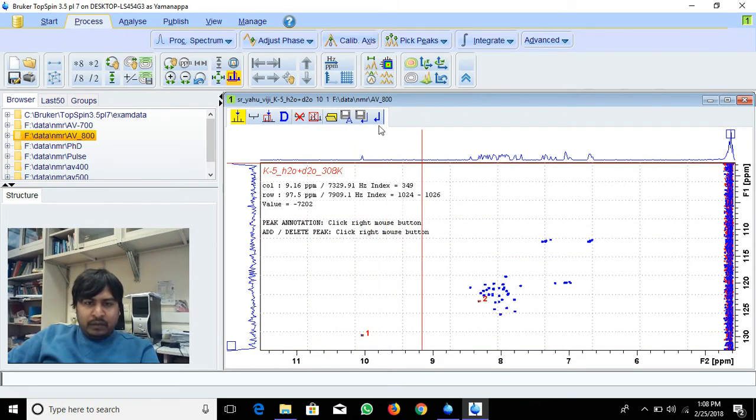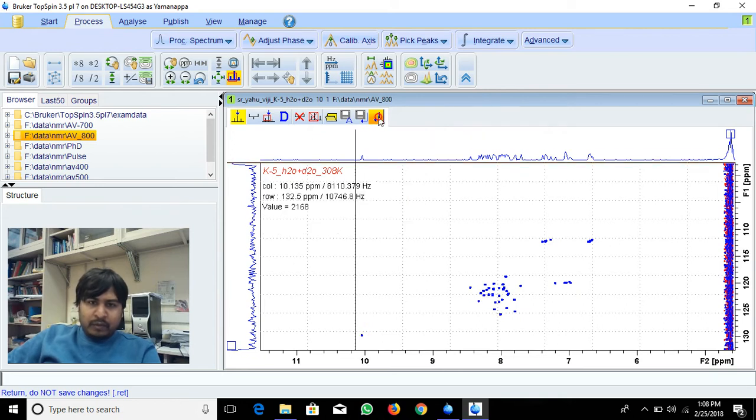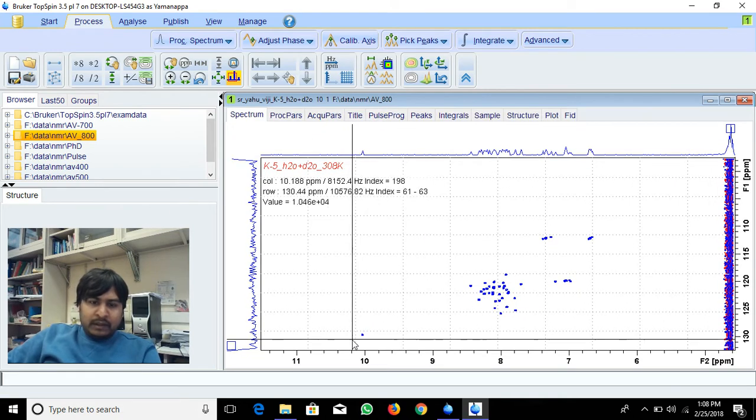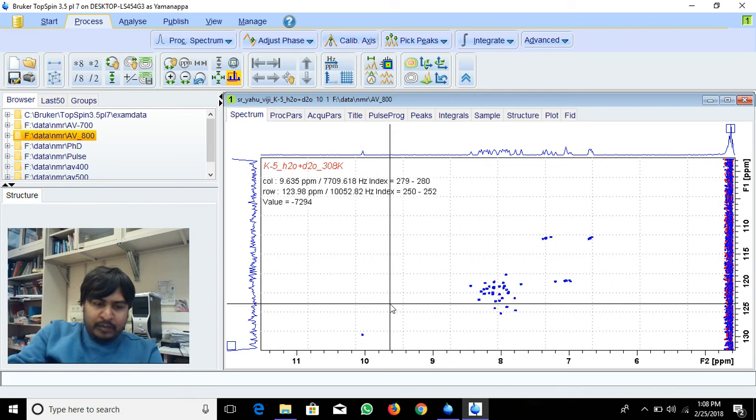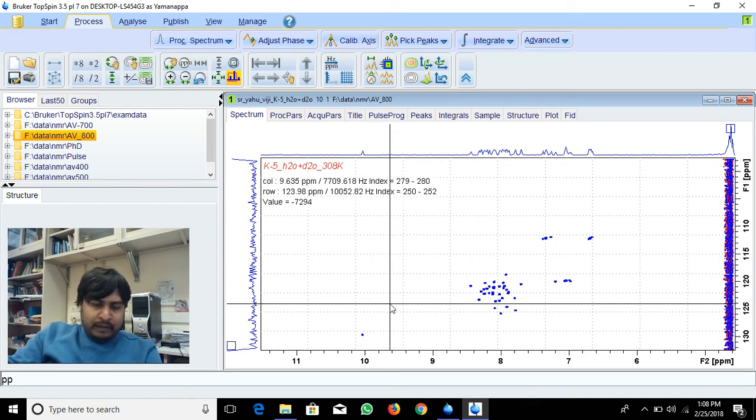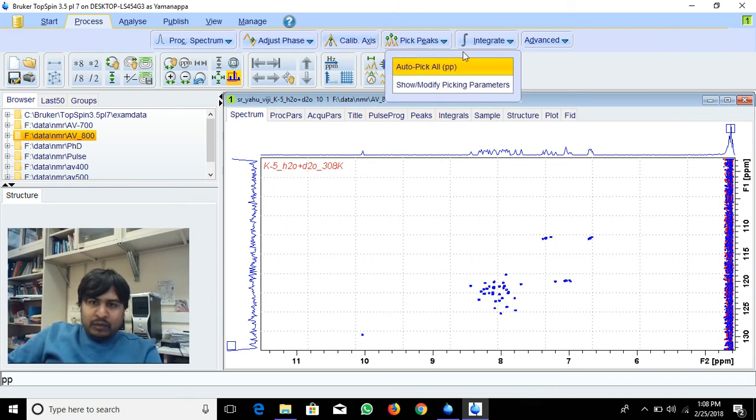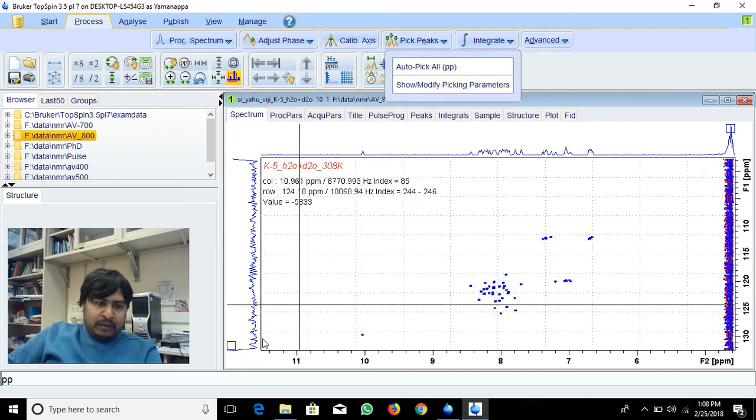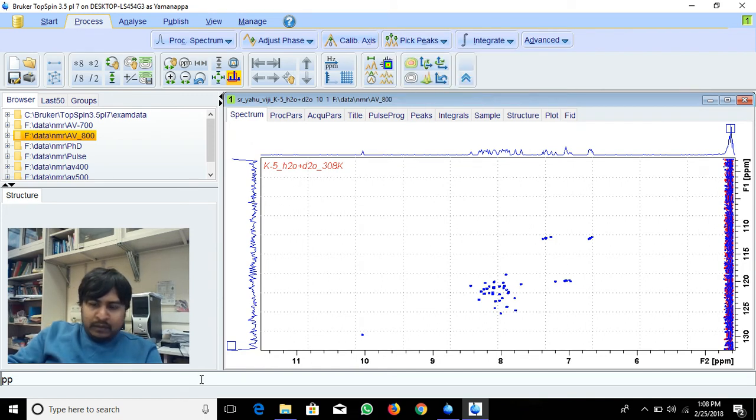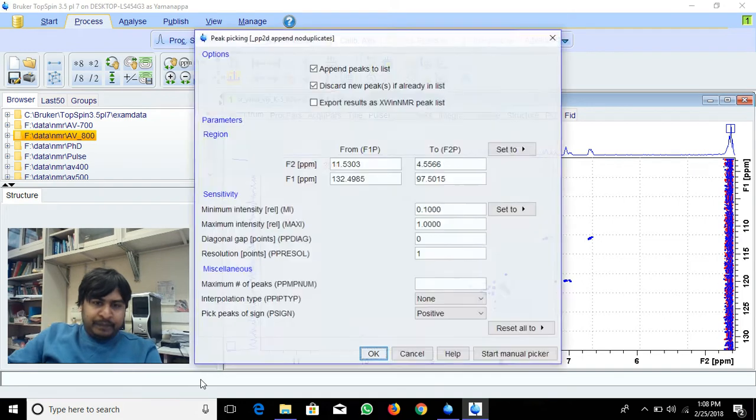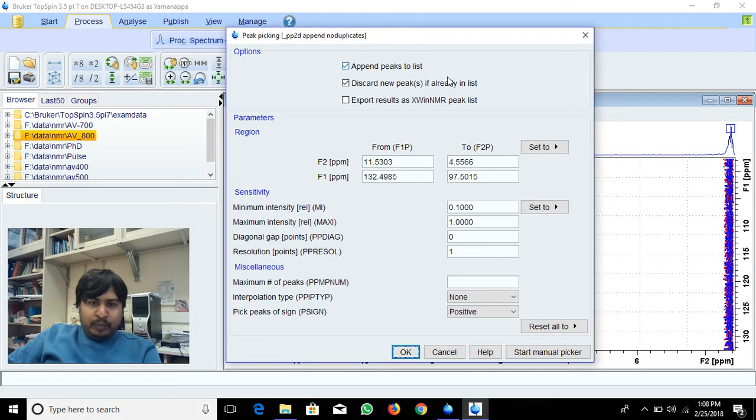This is how you can do manual peak picking in 2-dimensional NMR. Another option is to give a PP command, or you can do peak picking in 2D or auto-pick all. You can click that, or type PP and it will open a new page.